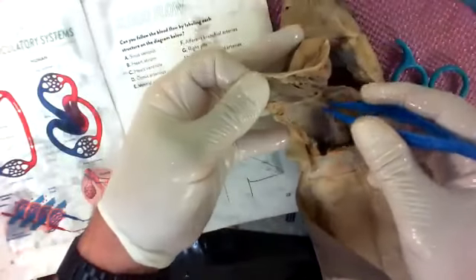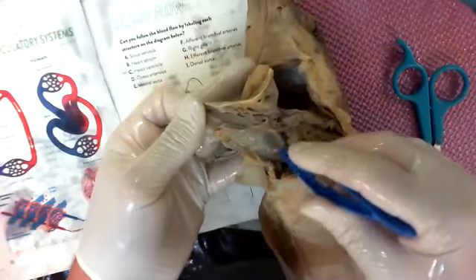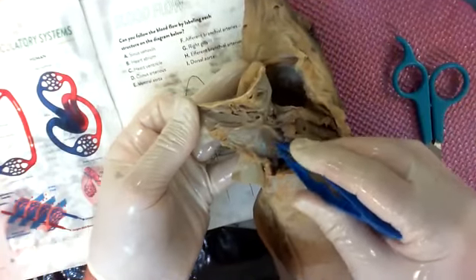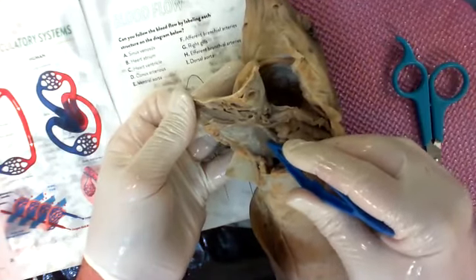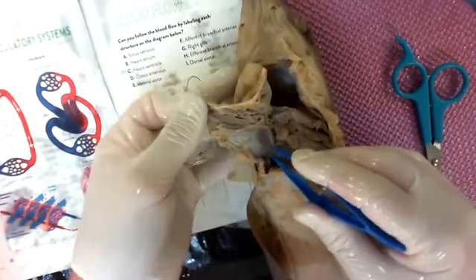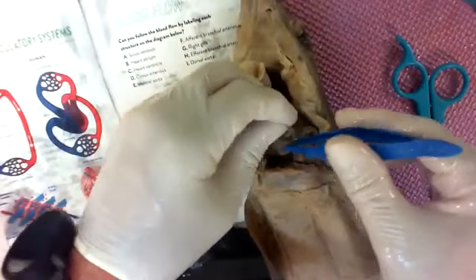So we just listed off all of those, whether you realized it or not. So let's take the heart out, kind of a fun thing. And it's so cool looking at stuff like that thin membrane through here that goes around the heart. It's called the pericardial membrane. You can see the gills on the other side of it. Man, I don't know if you can see those, but I can actually see it so thin and transparent. All right, I'm picking up the heart. And my goal is I'm going to cut it as high as I can on the ventral aorta.